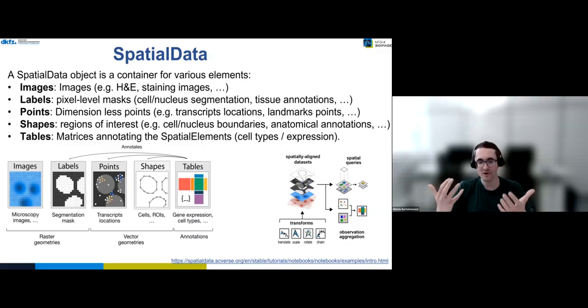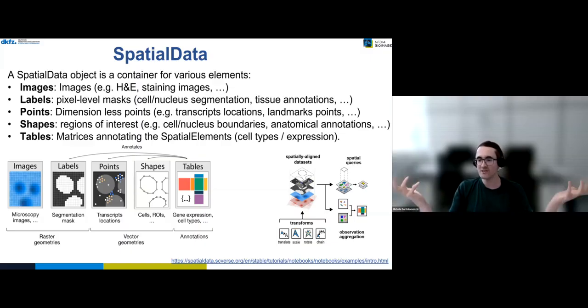And these tables are in the, let's say, background. They are AnnData objects with which some of you might already be familiar from the single cell analysis world and the whole scverse ecosystem. And another thing that I'd like to point out here at the bottom is that it's not just a container for all the assignments, it's also a very nice way to tie everything together, meaning that the annotations in the table are linked exactly to the labels and shapes they are annotated.